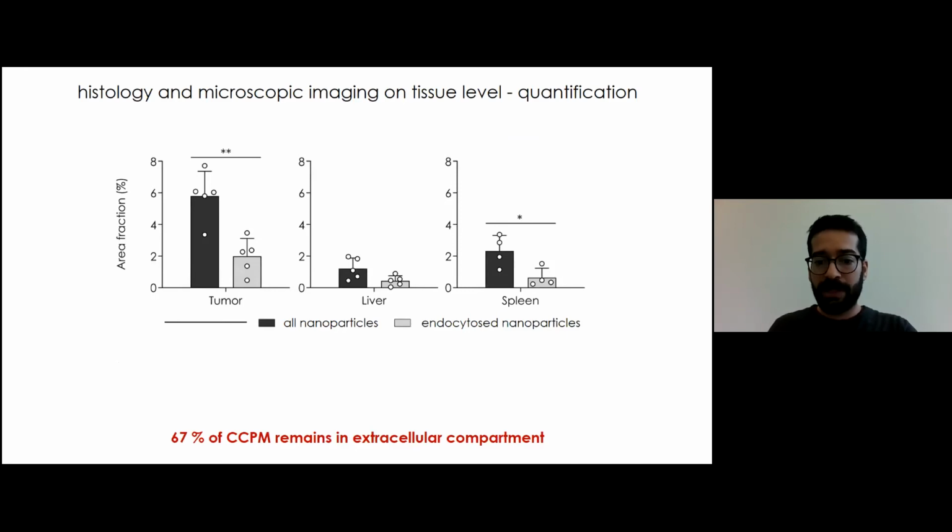And we observe the same pattern. So approximately 67% of nanoparticles remain extracellularly, and this is preserved among the different tissues.